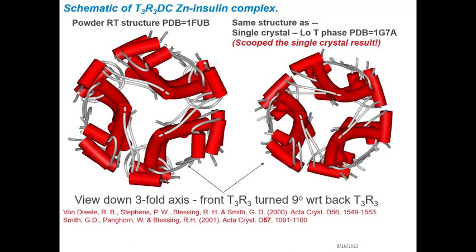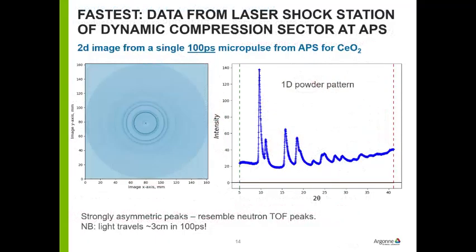So what's going on? Well, the action of grinding the protein induced a phase change from pressure. They got the same structure because they put cryoprotectant around the crystal, froze it, the cryoprotectant shrunk, and induced the phase change. So it's a pressure-induced phase change to get from insulin to this double c-axis version. Okay, that's amazing.